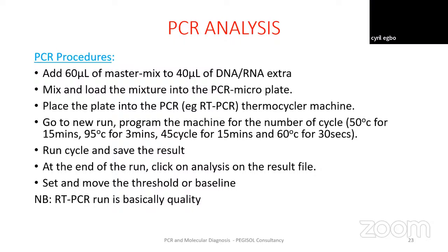So denaturation will happen to that 2 strand, which will now separate it into 4, for instance. As the 4 separates, then at the end of the day, denaturation will occur again to separate that 4 into 8. That is how the process goes.